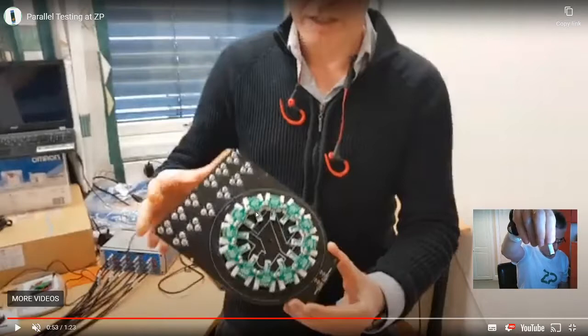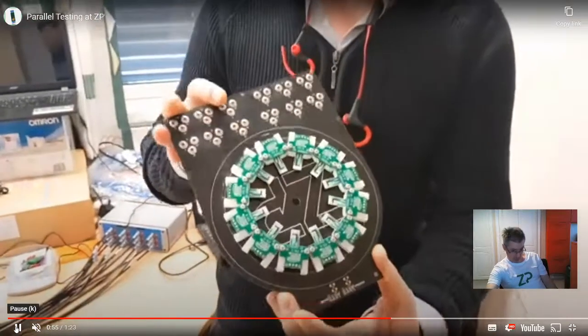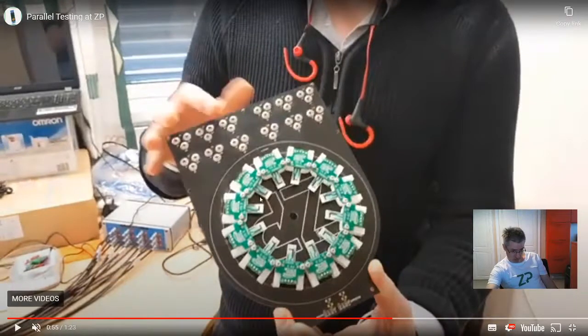In this version the electrodes are actually horizontal, which we use when we want to do pipetting experiments. You can just take a 50 microlitre pipette and pipette the solution onto the end of the screen printed electrode and do all your chemistry in that droplet — no formal container needed. It works well for aqueous solutions as they tend to form a droplet, but organic solutions can spread everywhere.